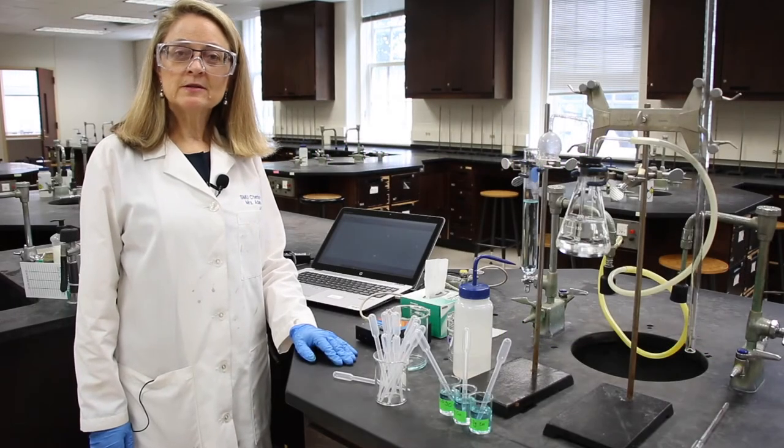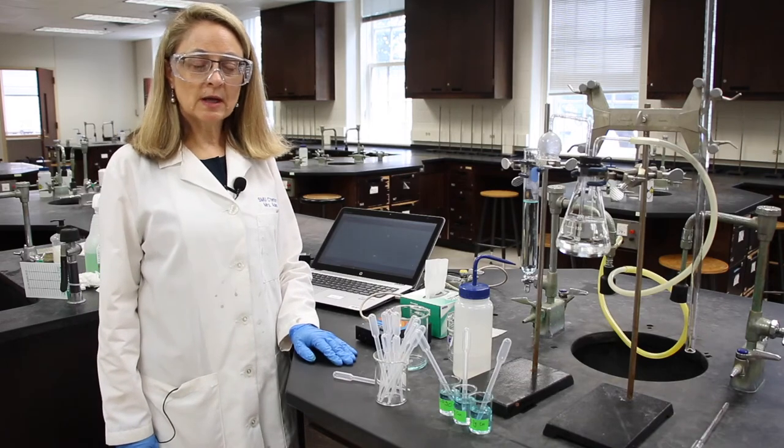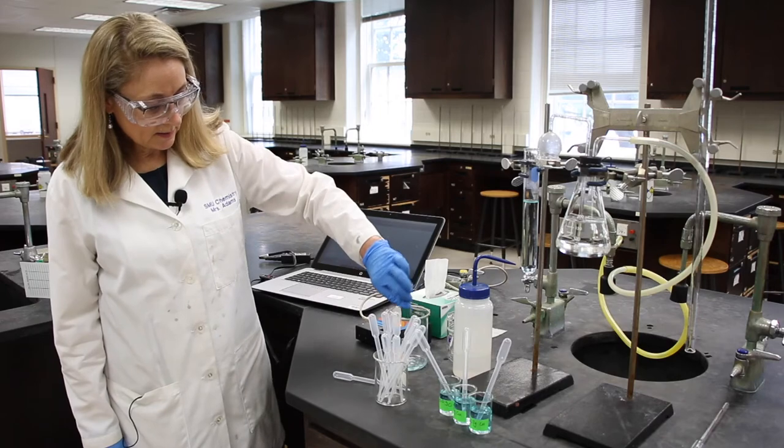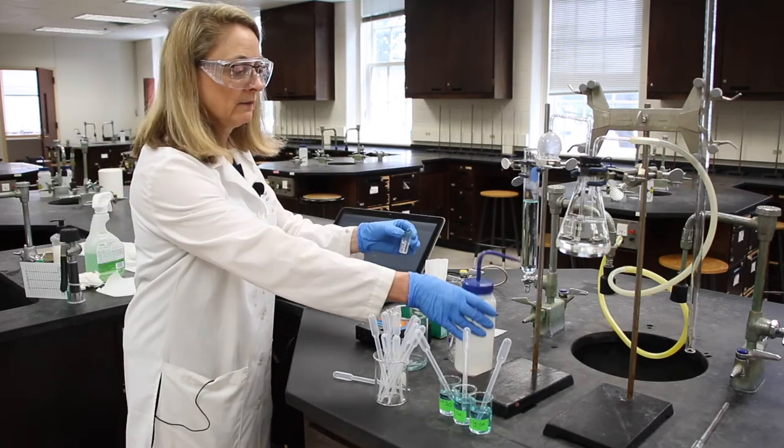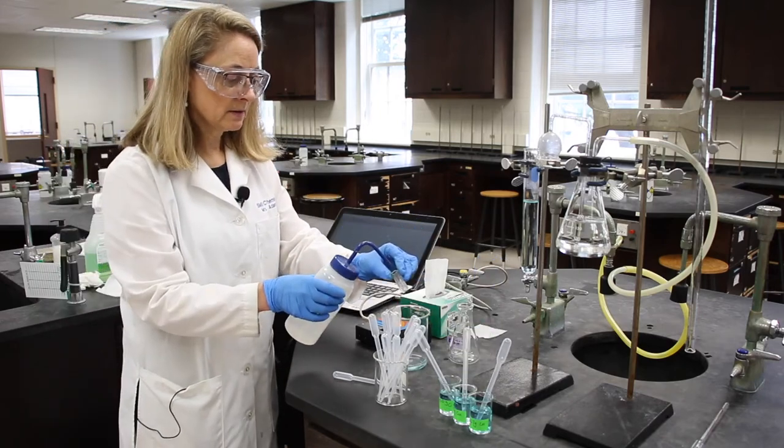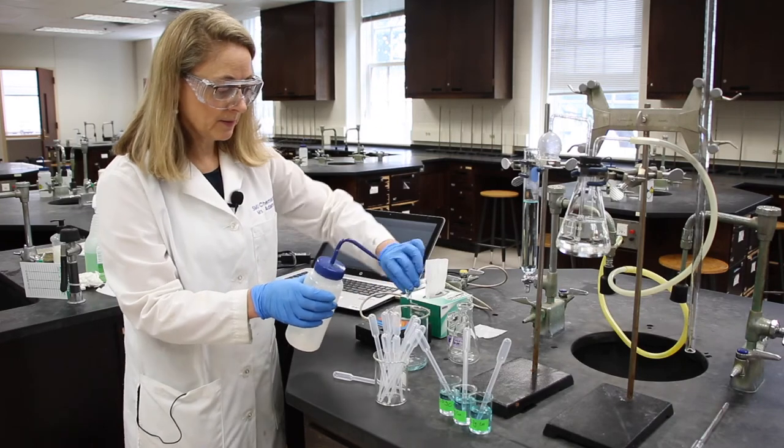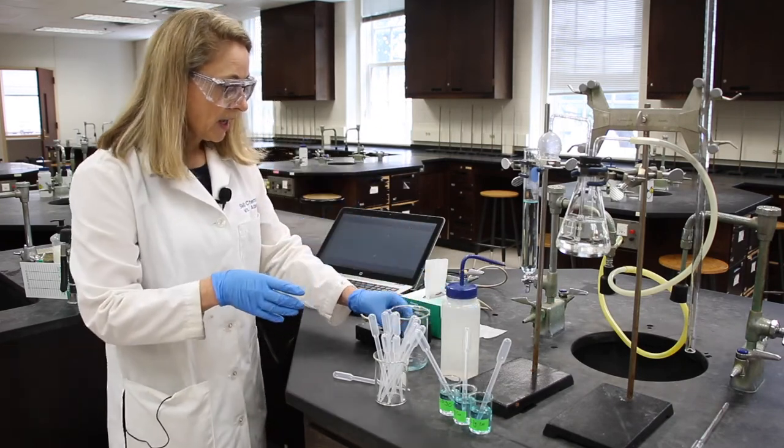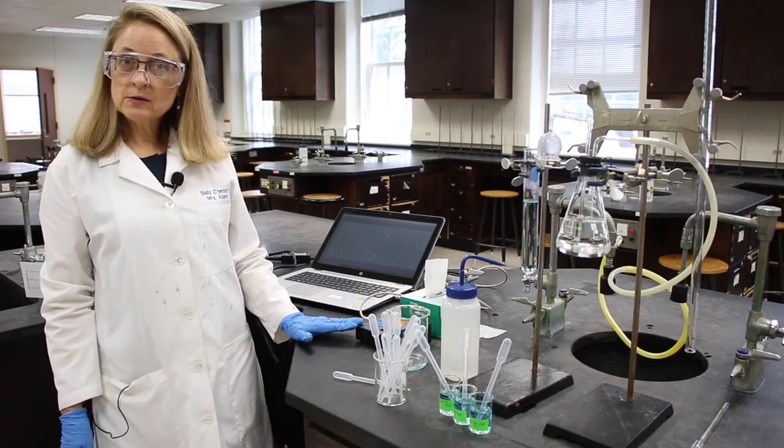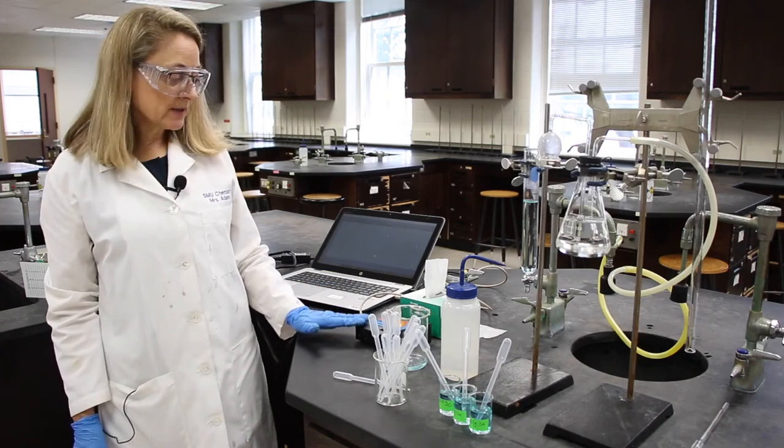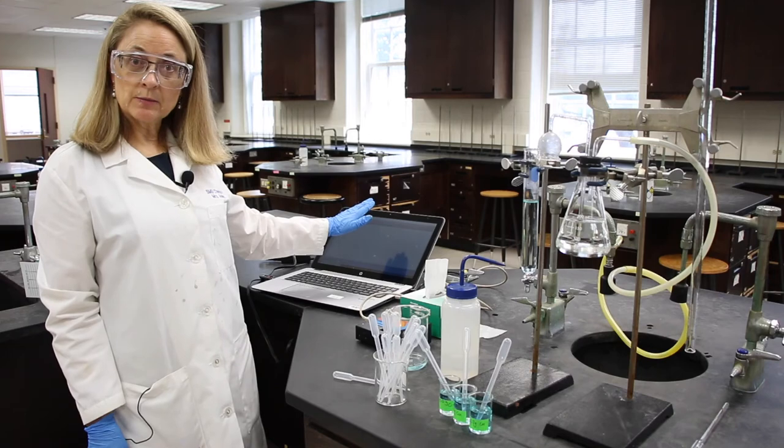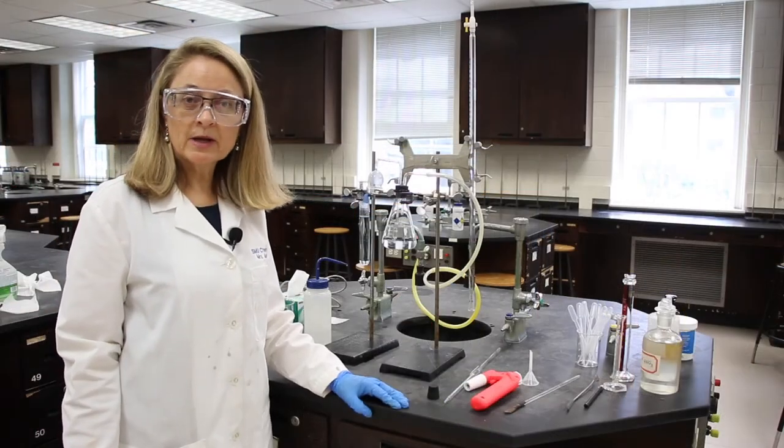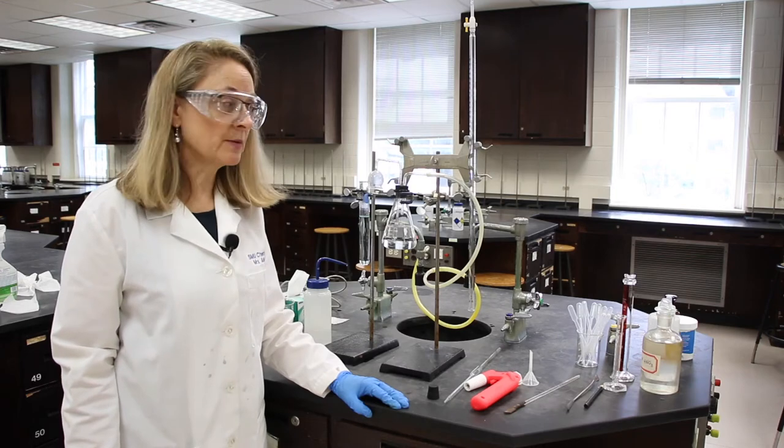Now that we've determined the absorbance of our unknown sample, we can get rid of that to waste. And give the cuvette a little rinse for the next people. And then shut the strobe, or the light, off to the spectrometer and shut down the computer. Now that we've finished our copper determination, let's move on to our silver determination.